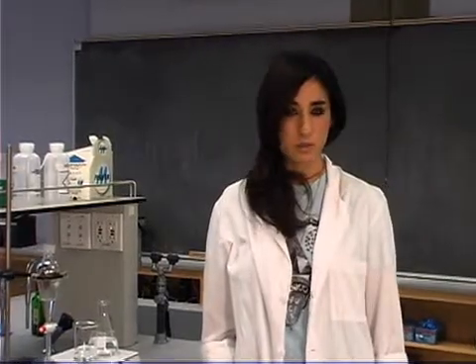Hi, today I'll be demonstrating both micro and macro scale extractions. This technique is used to move a compound between two immiscible solvents.